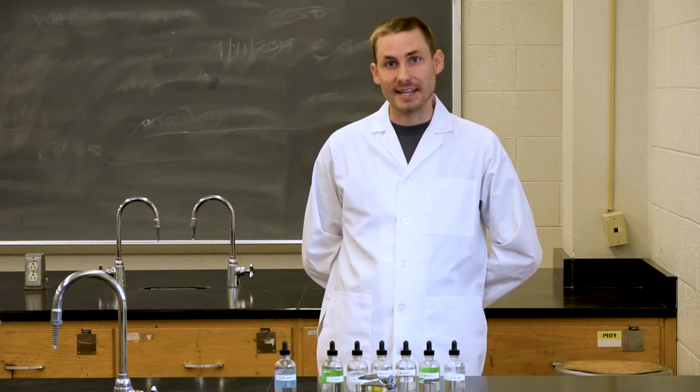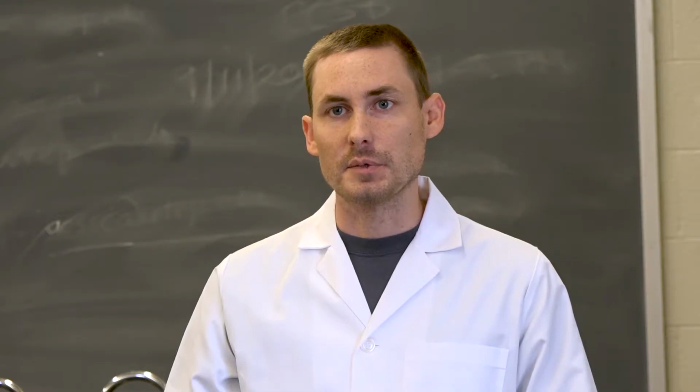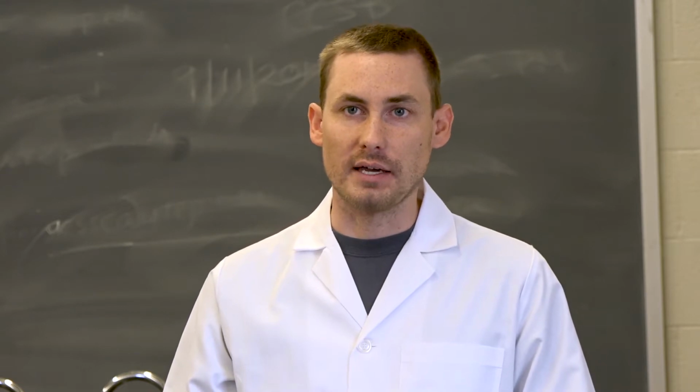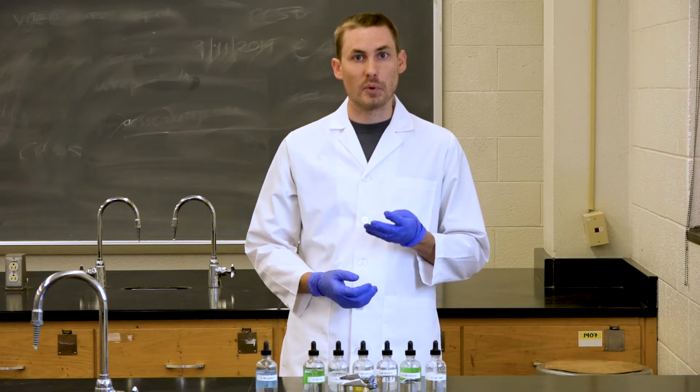My name is Reagan, and today we're going to be doing Experiment 20, Qualitative Analysis. This experiment will teach us how to determine which ions are in a solution, or which mixture of ions is in a solution. After this experiment, you will have learned 4 important skills.